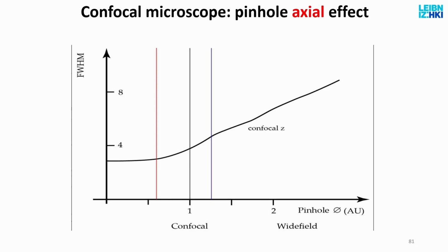Anything else? Yeah. Maybe could you comment on the Apotome microscope from Zeiss? Yes. We have too little time here, unfortunately, but if you guys have a bit of patience, there is such a thing as structured illumination microscope.